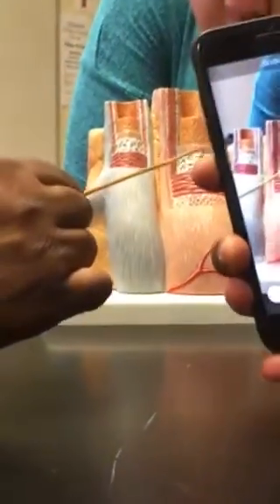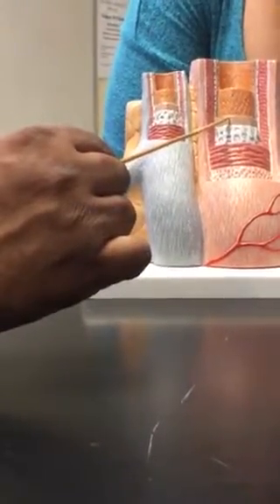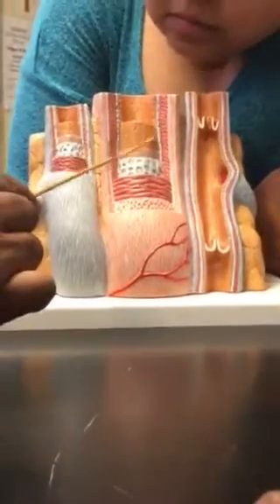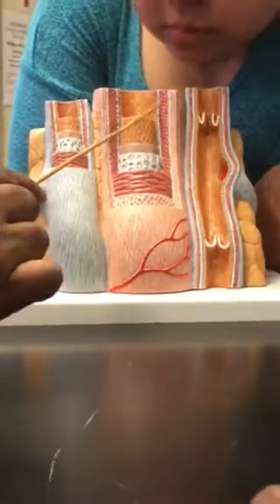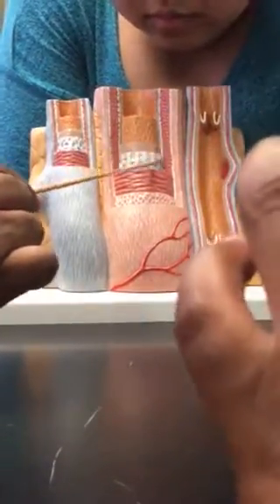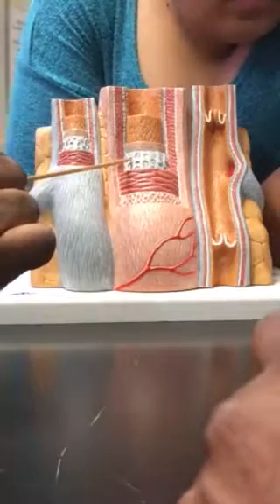borders of cells right here. This makes up the subendothelium. Okay, so again, all the way around, subendothelium. The next one we have is the internal elastic lamina. See this white band that we see here running all the way around? That is the internal elastic lamina.